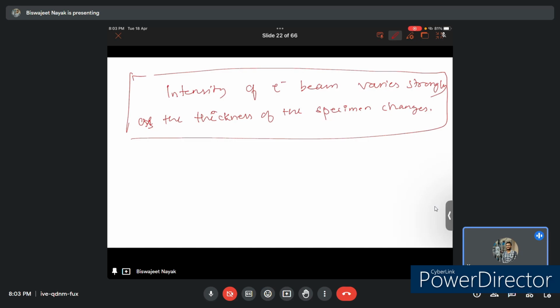What we see in the diffraction pattern relates directly to the beam, because the diffraction pattern, whether in the microscope or on a print, is whatever we see outside the crystal. So what do we need to calculate here? We need to calculate the intensity of the beam at the exit surface of the specimen.